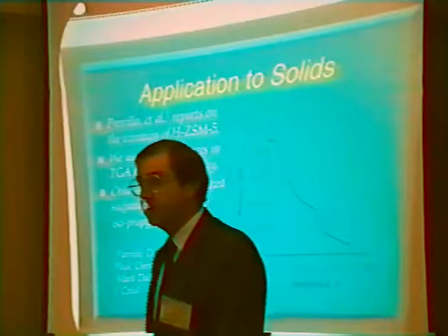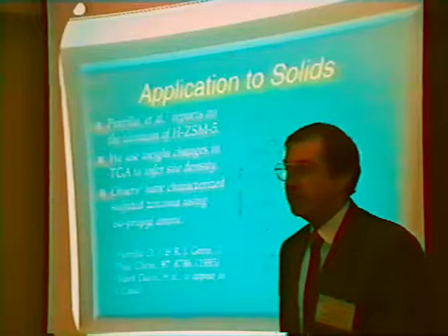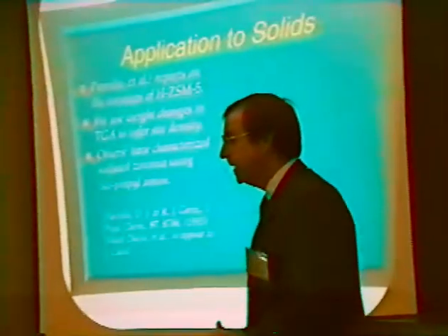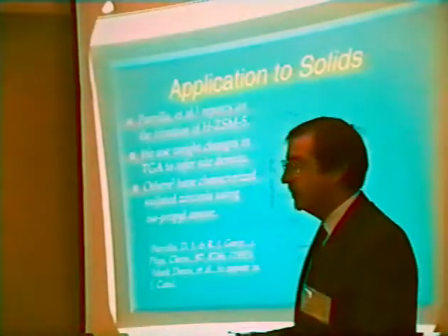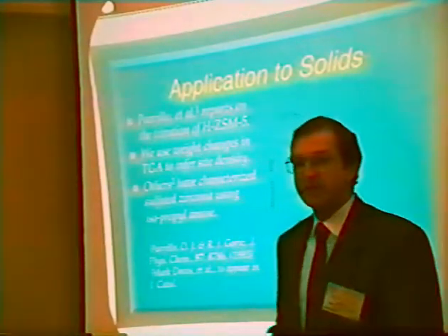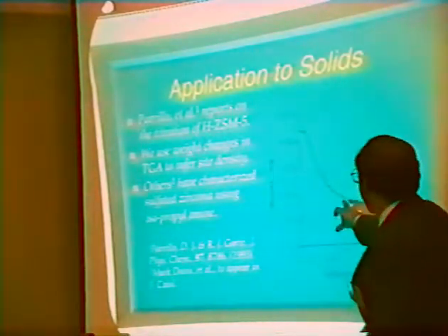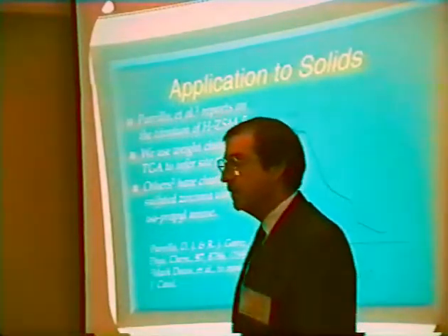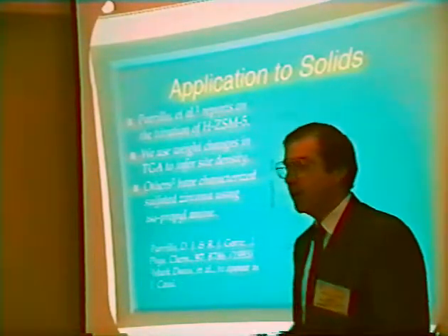And we've also noticed the same thing when we reproduced their work. Ray also followed the evolved gas analysis, that is, measured and characterized the gases that were coming off from this. And what he noticed, and we have noticed as well, is that the lower temperature weight change produces gases which are mainly amine, that is, just desorption without any reaction. However, the higher temperature weight change is attended by evolved gases that contain the olefin and ammonia, and that's the signature of the reaction, the Hofmann reaction.